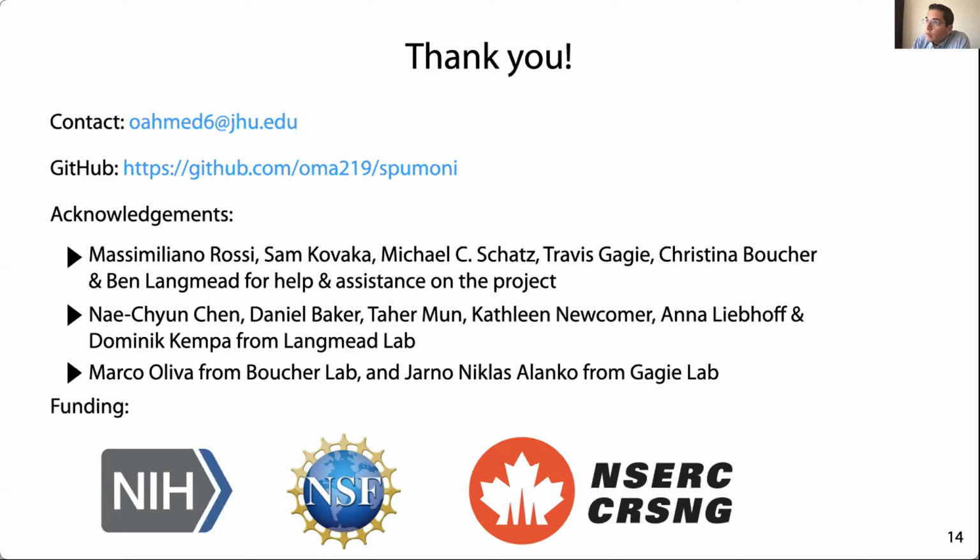Yeah, that's a good question. So we spent a lot of time recently benchmarking SPUMONI. One bottleneck could be the data structure, but I think we've really optimized that. And there's actually future work done by some other students that will help to optimize the r-index to make it faster. But also in future development we've been looking at whether we can index smaller sequences using sketching approaches to help us speed up the actual query process. So that's one potential for future development to help speed up the underlying query.